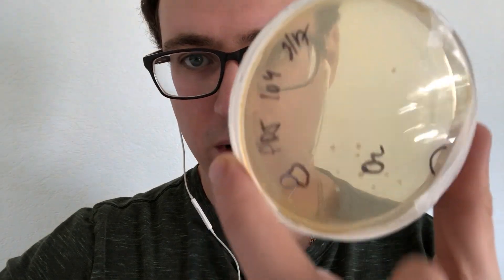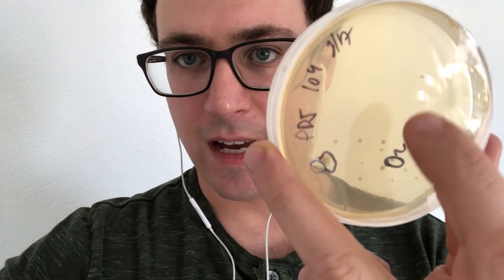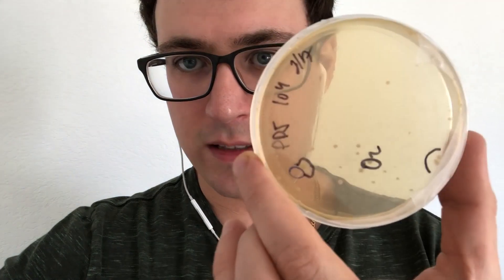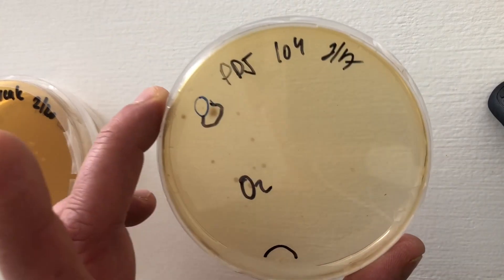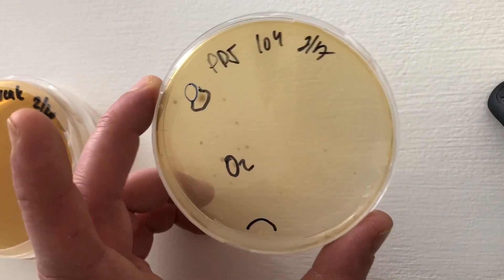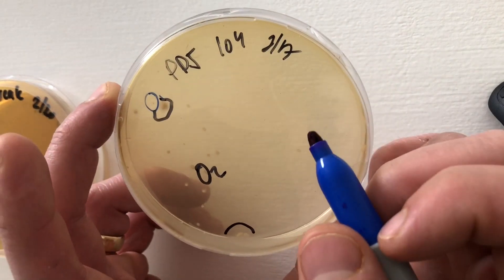We've got two or three colonies that were from yesterday and you can see all these new ones. So I'm going to label them kind of by size too and then they'll have their own petri dish to grow so they won't overlap. Okay, these are the colonies that were there yesterday so I'm just going to go ahead and start labeling these.